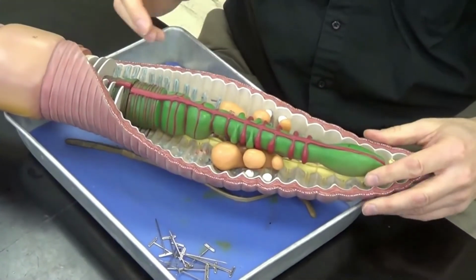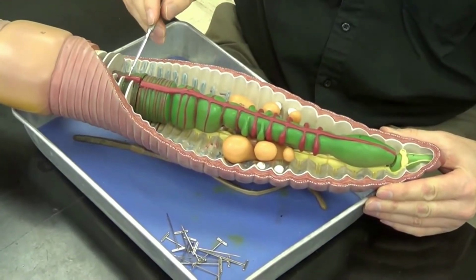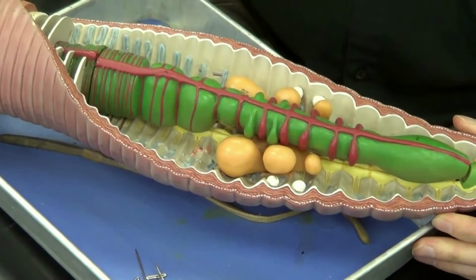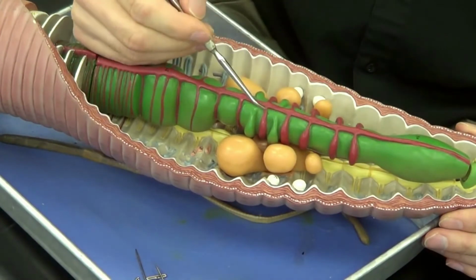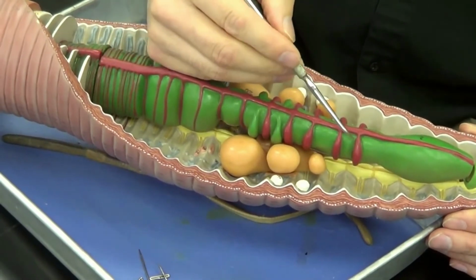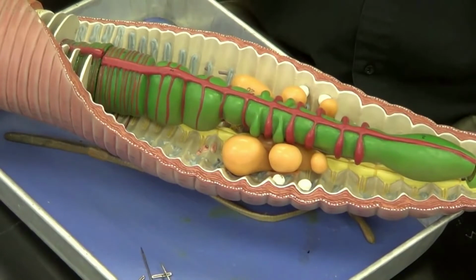Now let's take a look at the blood vessels. We're going to see three major blood vessels on this worm. The one blood vessel you can see right here is probably going to be the most prominent. It's going to be called the dorsal blood vessel, and its job is to return blood to the headward region. And then we can see some dilated blood vessels here on either side, and these dilated blood vessels are called hearts or aortic arches.